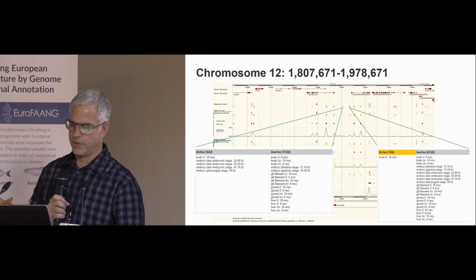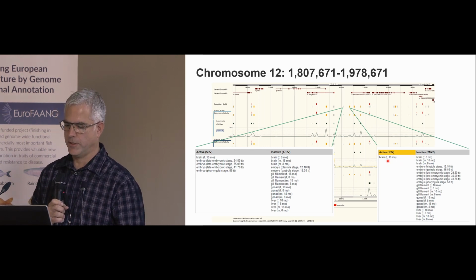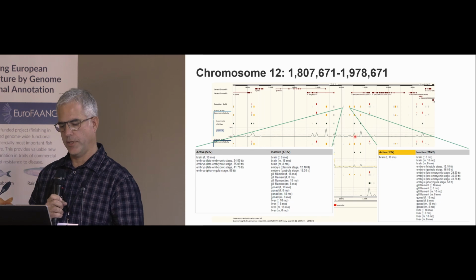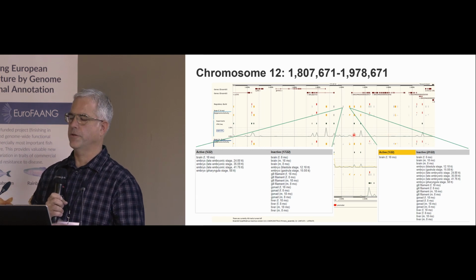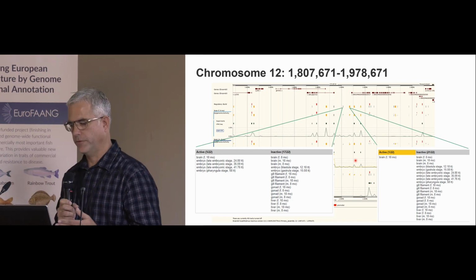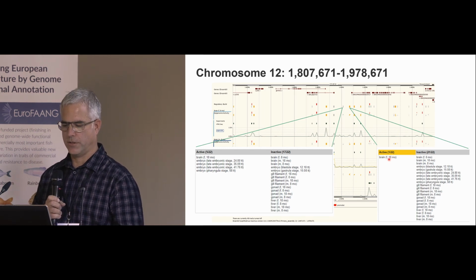So for example, just starting on the right here, this regulatory feature is coming through as just brain, female, 18 months. But if you look below, you'll see there is some signal here, and the background, as you can see, is pretty good, in that the regulatory features are really standing out nicely here. So there is some signal, but it's just not significant enough. And the question is, is this just one of those borderline cases of activity? As I say, you can't just take this as the label says. One needs to do further investigation.